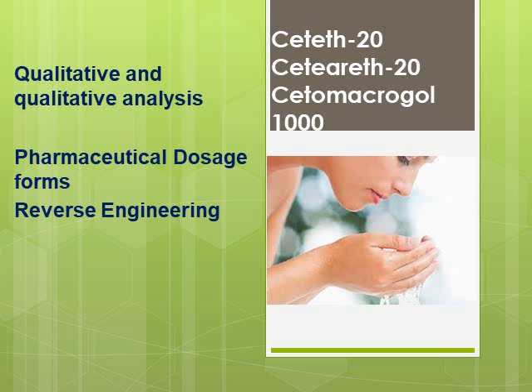In this slideshow, I'm going to talk about three different excipients: Ceteth 20, ceteareth 20, and cetomacrogol 1000. This presentation is useful for people who are doing reverse engineering of pharmaceutical dosage forms or cosmetic products.